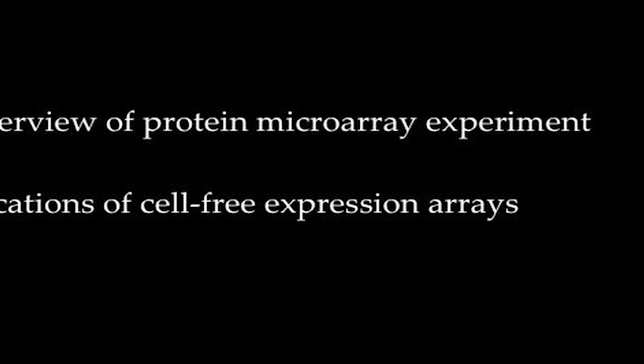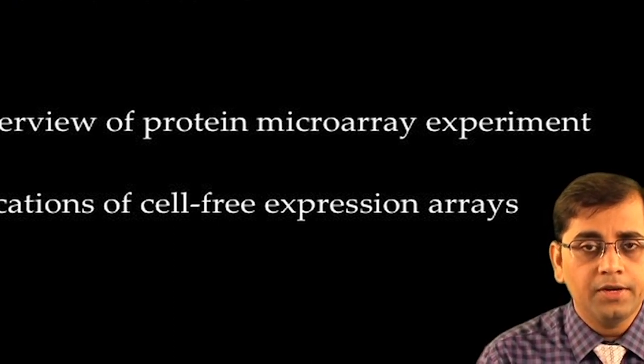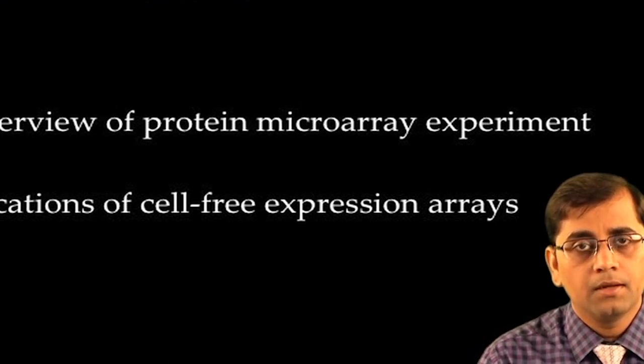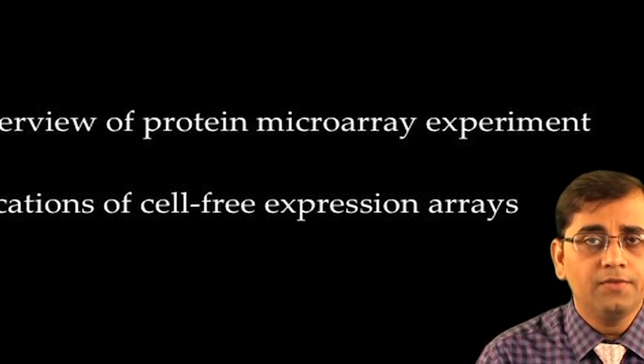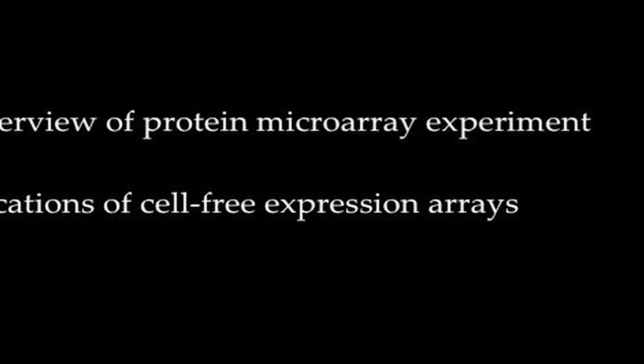In today's lecture, we will start with an overview of protein microarray experiment. I will then describe a few applications very briefly by discussing some relevant case studies. This will provide you an overview of how these platforms could be used for a wide variety of applications, including biomarker screening.